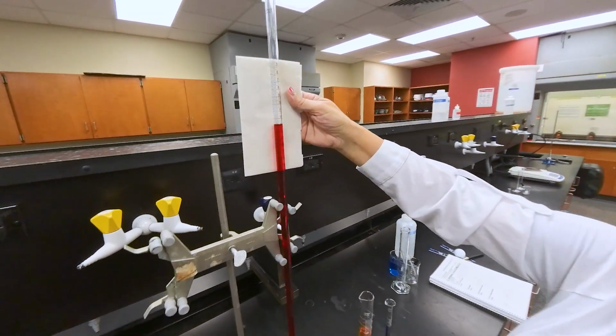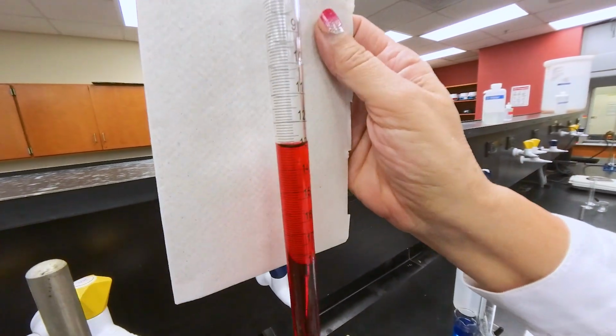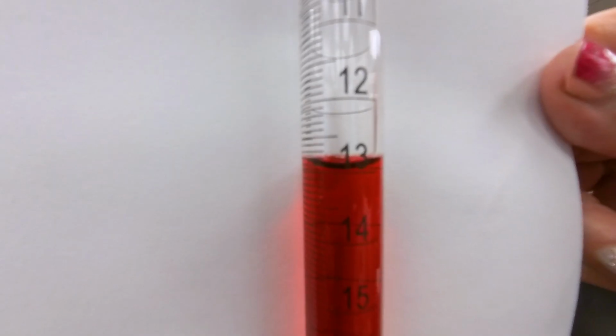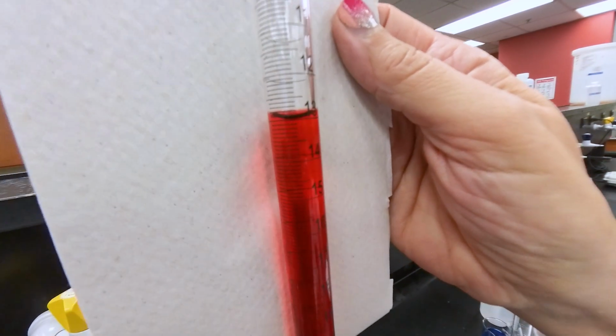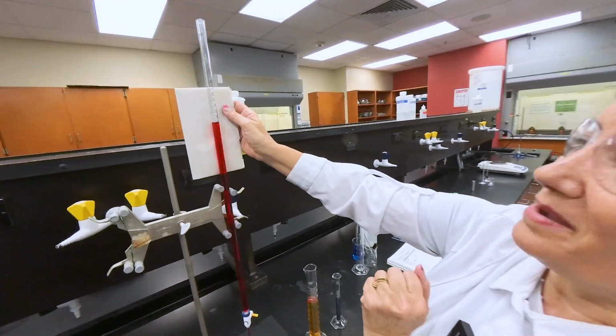I'm holding this white background around it because it's a better technique for reading the number at the meniscus. It's easier to see with the white background, and the purpose of this color is just to make sure that you can see better behind the camera.